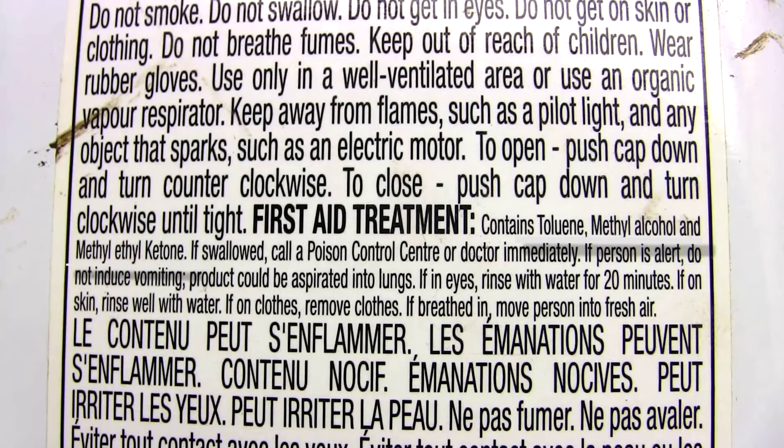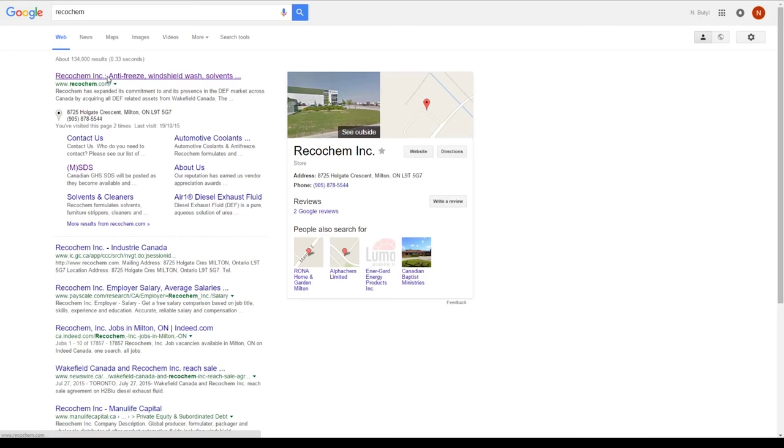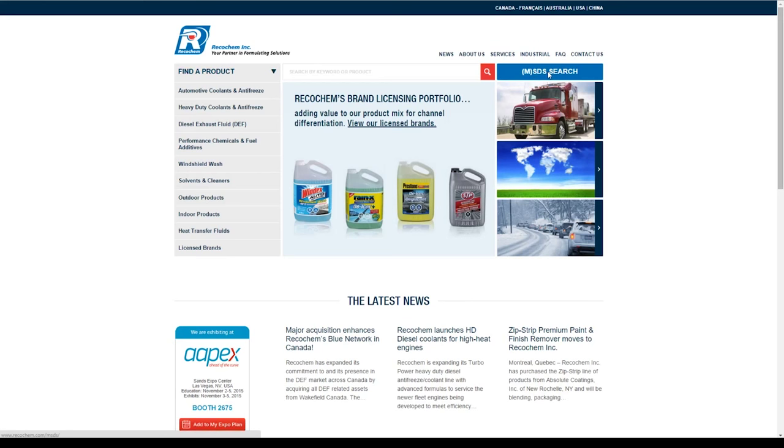Since I have no other choice I'm going to try and fractionally distill off the toluene. Now before we begin we have to figure out if it's even worth doing. If the toluene composition is very low then it might be more worthwhile to search for other sources.